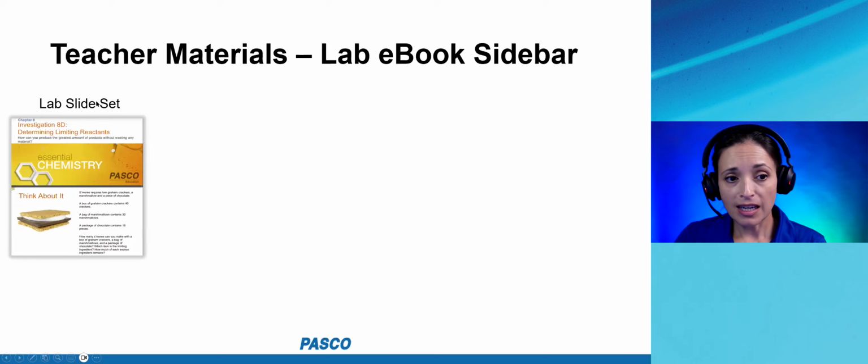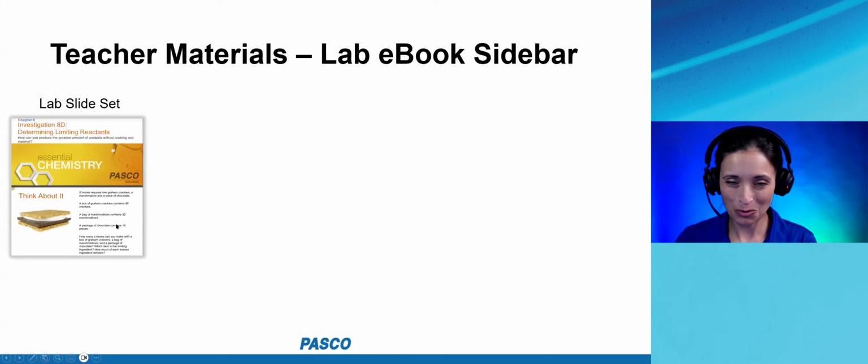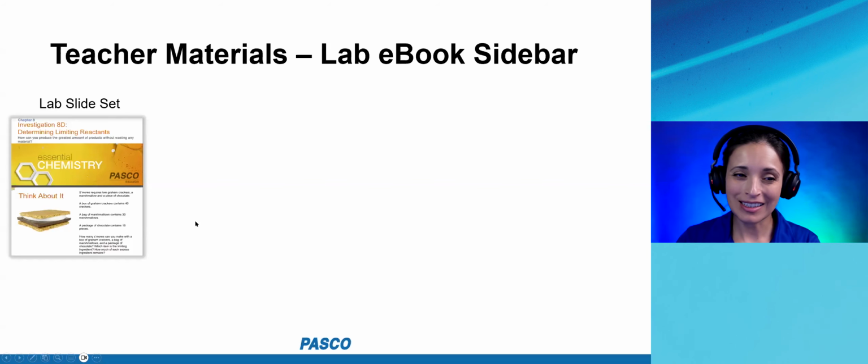You'll see a slide presentation that goes along with the lab procedure with an introductory question called Think About It. This goes with every lab. There's always a Think About It slide that gets students engaged and thinking about what the concepts are and how to think through the challenges in the lab ahead.